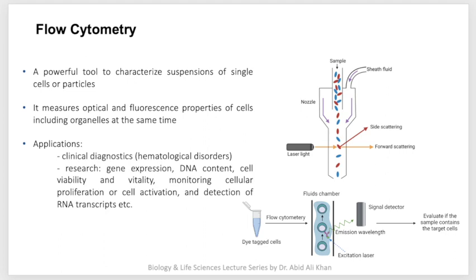These are just intensity units. Similarly, on the side scatter, the eukaryotic cell will end up way over bacteria, because bacteria's internal complexity is pretty simple. There is only a nucleoid region, there is no membrane-bound nucleus, and there are no cellular organelles. So that's how we refer to the internal complexities.